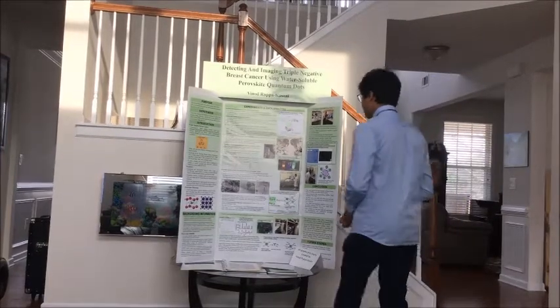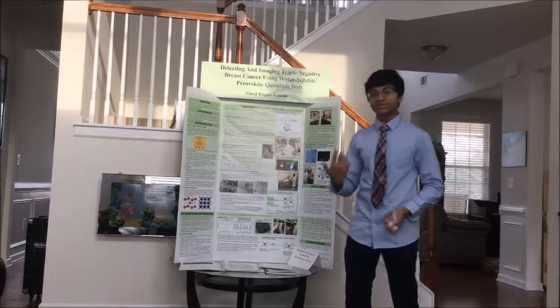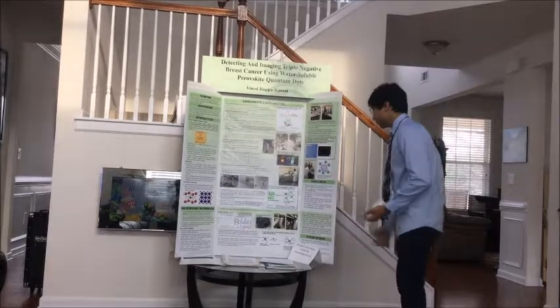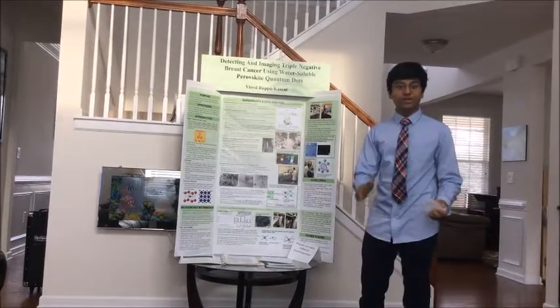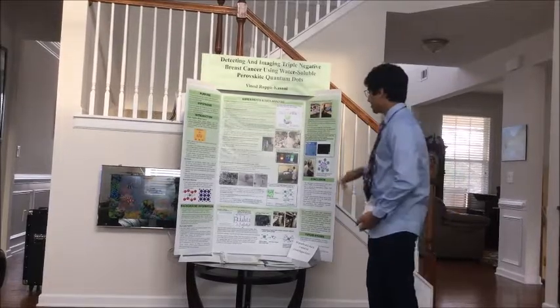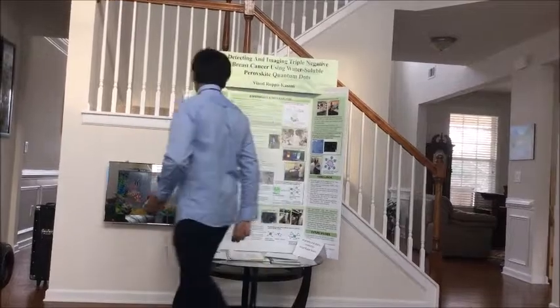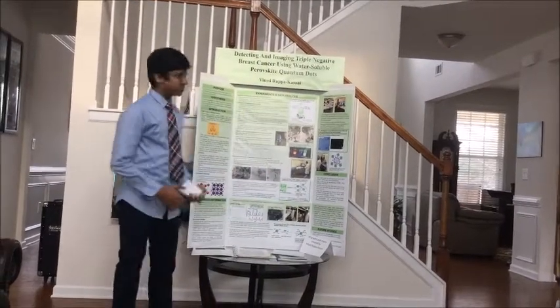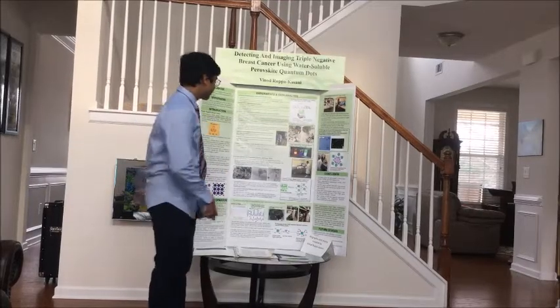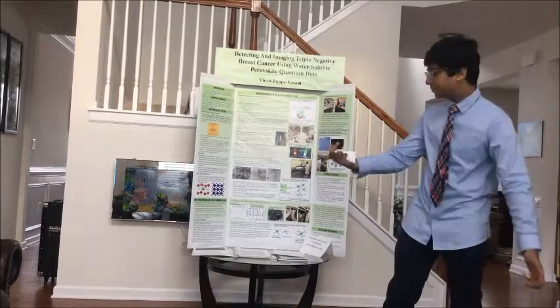Then I took some more results after I polymer coated it, because it was part of the experiment. I got the TEM image of my polymer coated PQDs. I'm just saying that I only used the green PQDs for this because the results will be the same for red and blue. You can see in the TEM image how it definitely increased in size, because it's 30 nanometers now. And that's expected, because you added a polymer to it, so it got bigger.